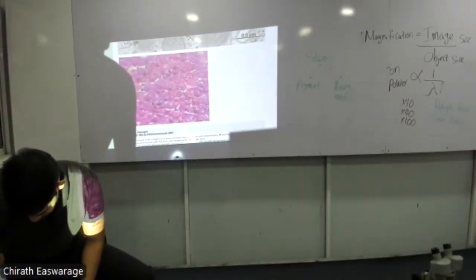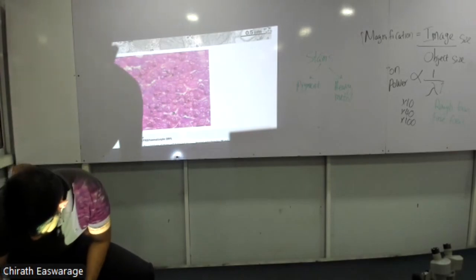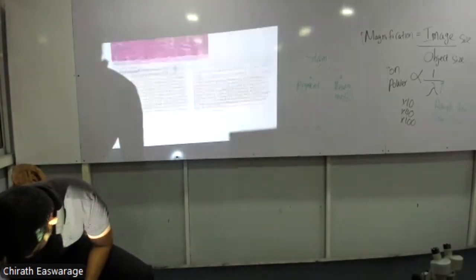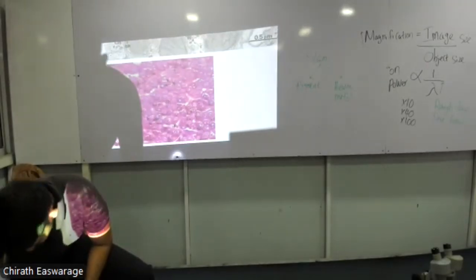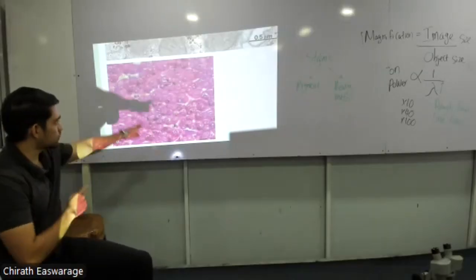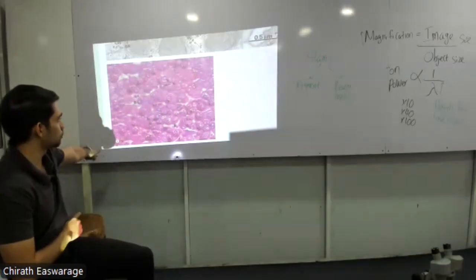This is a light microscope, right? Medium power. What are B? B are blood cells. These are muscle, I think. Yes. You can see some glycogen, right? Glycogen, stored in muscle, right? This is a light microscope image under medium power, right?